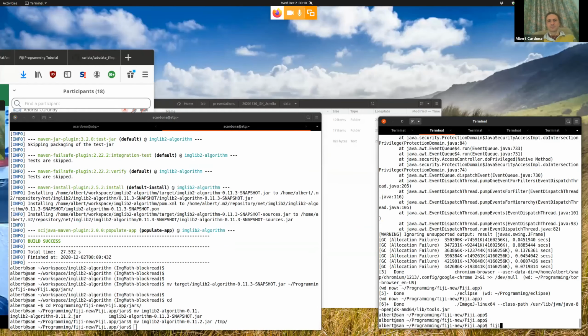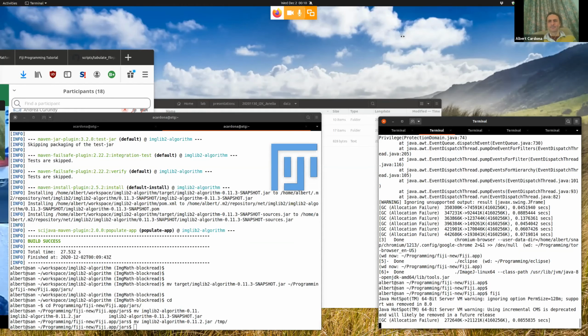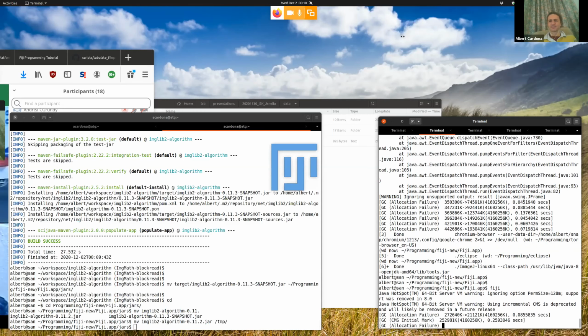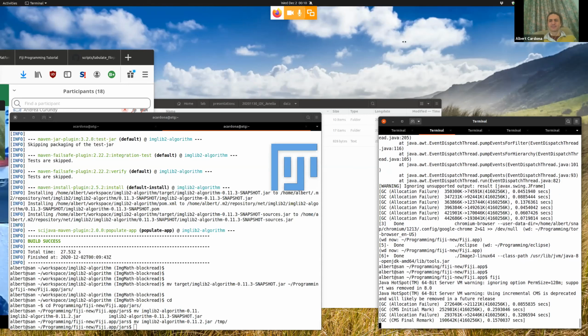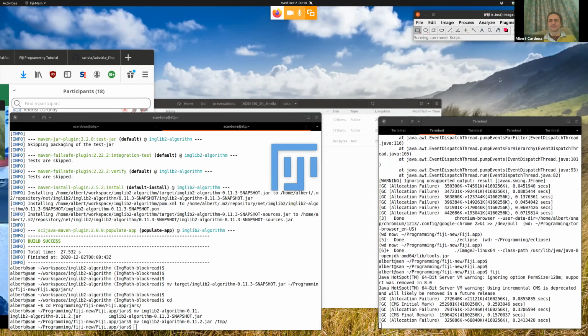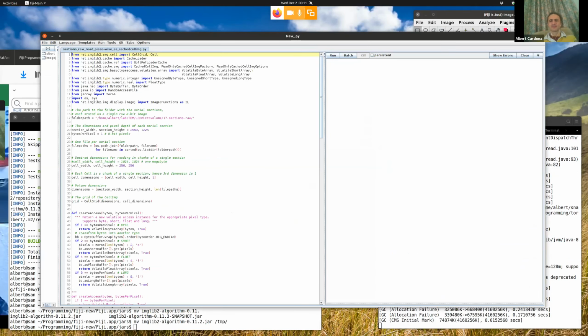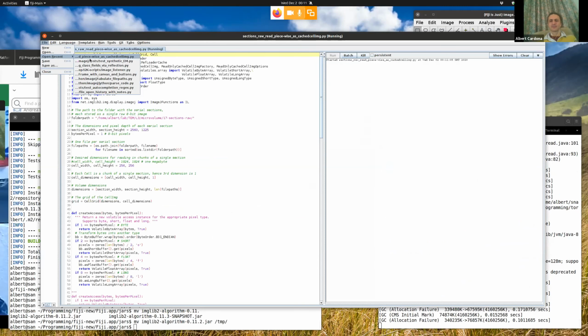Come back again, please. Goodness, that's taking a very long time. Okay, Fiji, new script. And let's open recent. We had this one, which we want to run. And we had that one.